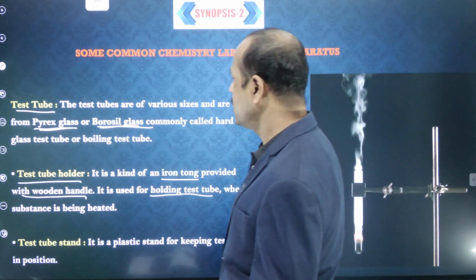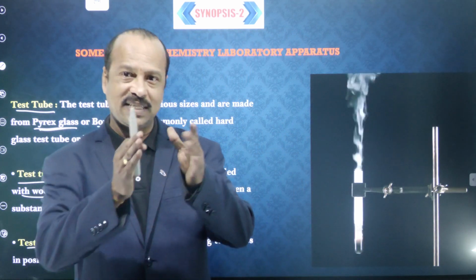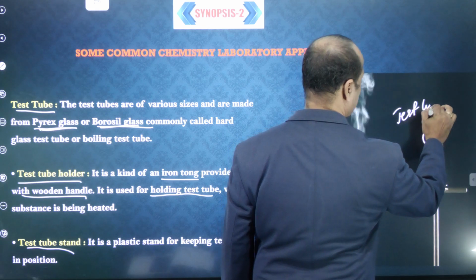And then you see the test tube stand. Whenever we want to fix the tubes, this is a test tube stand. Can you see here? This is the test tube stand.